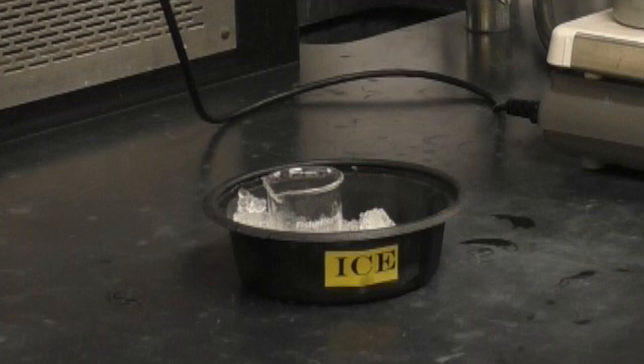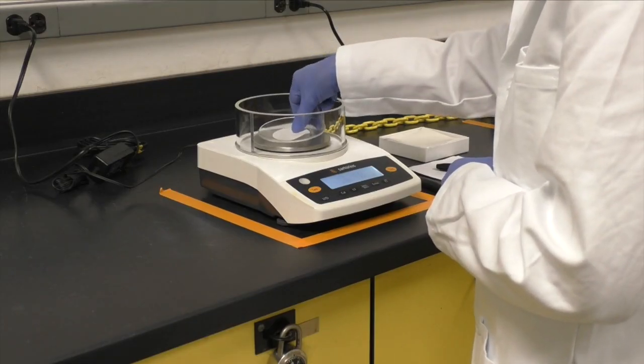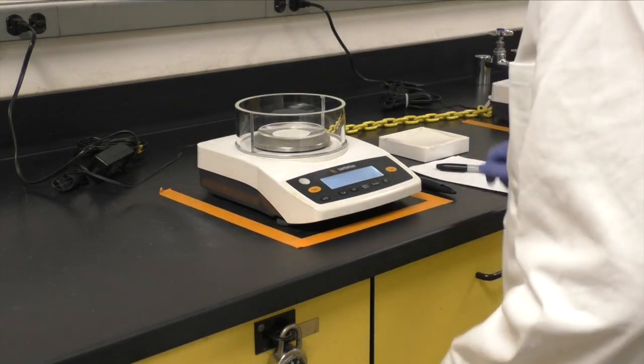While the mixture is separating, put about 10 to 20 milliliters of 95% ethanol in an ice bath to chill. Also, pre-weigh a piece of filter paper and a watch glass.